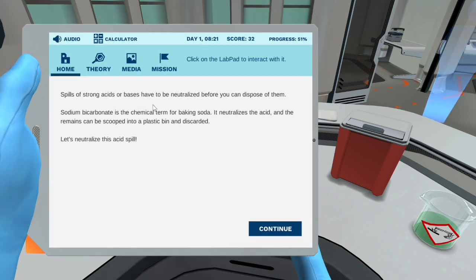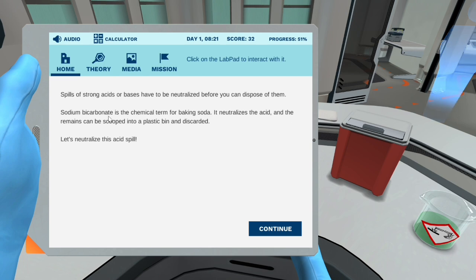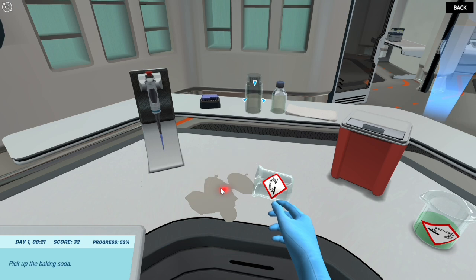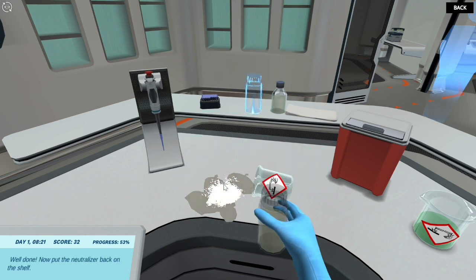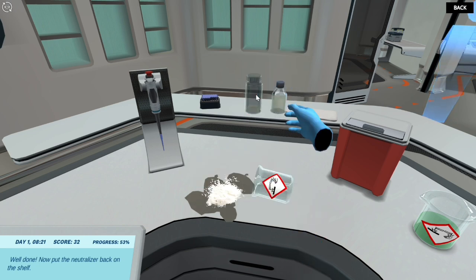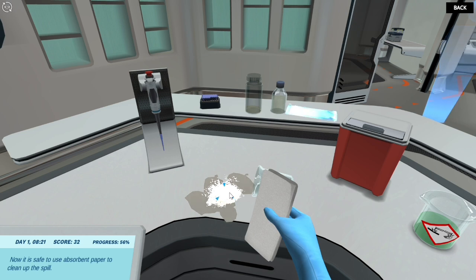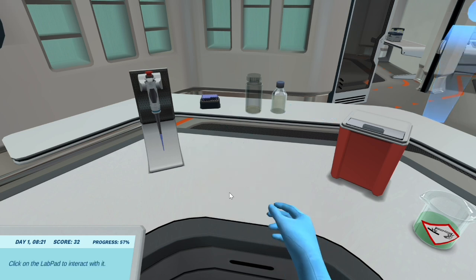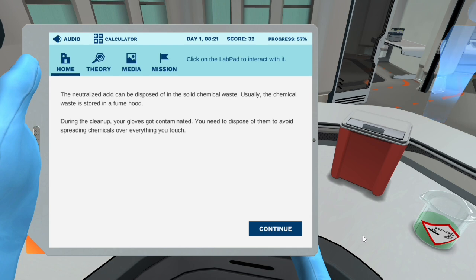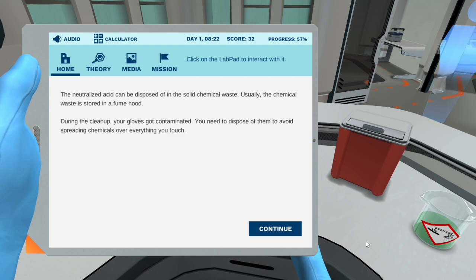Spills of strong acids or bases have to be neutralized before you can dispose of them. Sodium bicarbonate is the chemical term for baking soda — it neutralizes the acid, and the remains can be scooped into a plastic bin and discarded. Let's neutralize this acid spill. Pick up the baking soda and put it on the spilled solution. Well done! Now put the neutralizer back on the shelf. Now it is safe to use absorbent paper to clean up the spill. The neutralized acid can be disposed of in the solid chemical waste — usually the chemical waste is stored in a fume hood. During the cleanup, your gloves got contaminated. You need to dispose of them to avoid spreading chemicals over everything you touch. Click on the trash bin to discard your contaminated gloves.